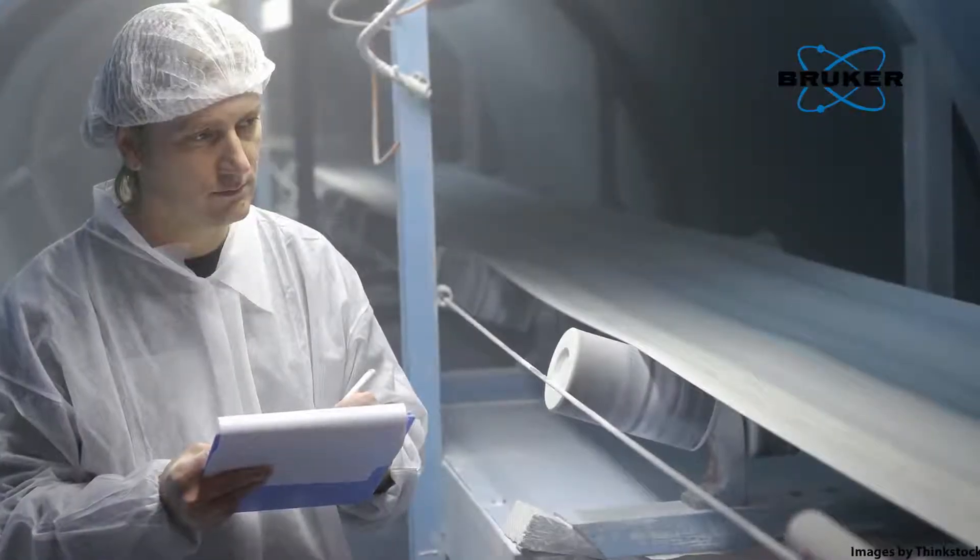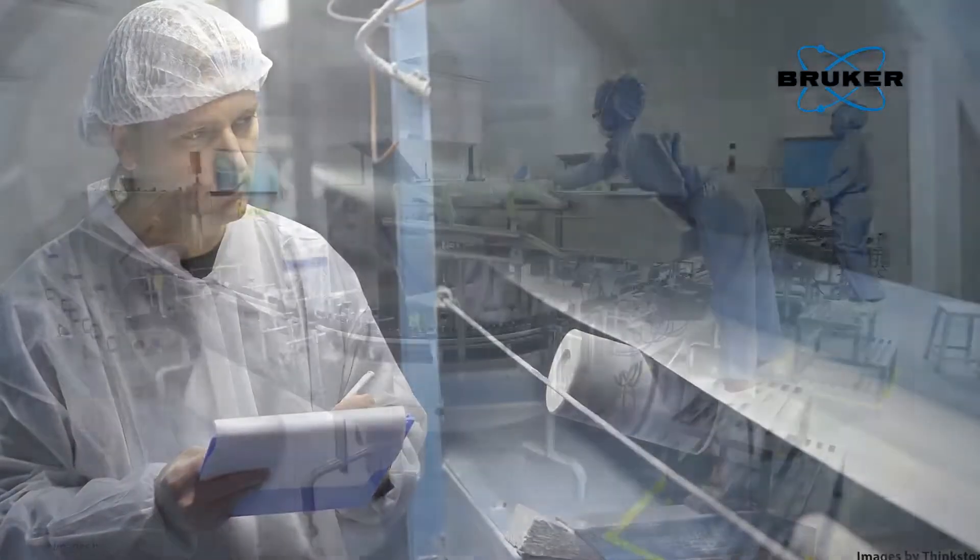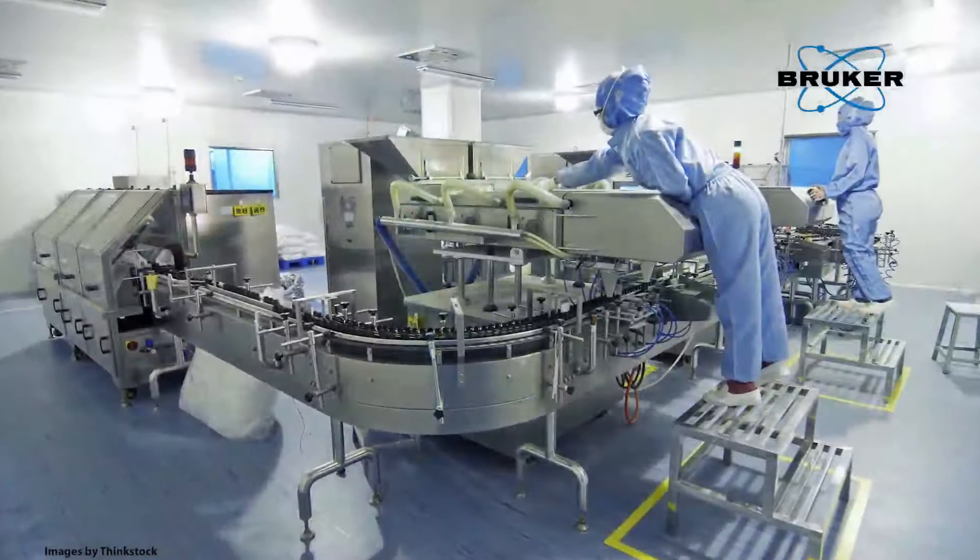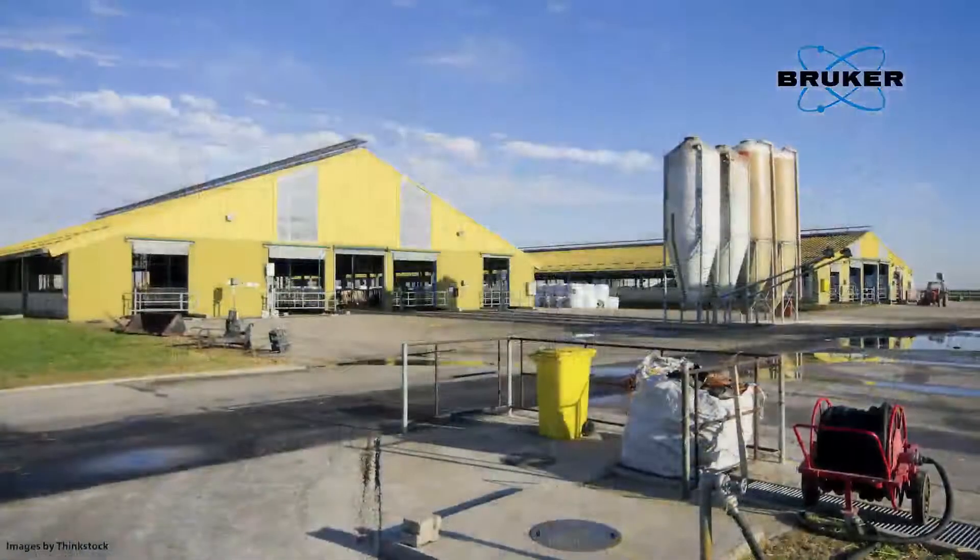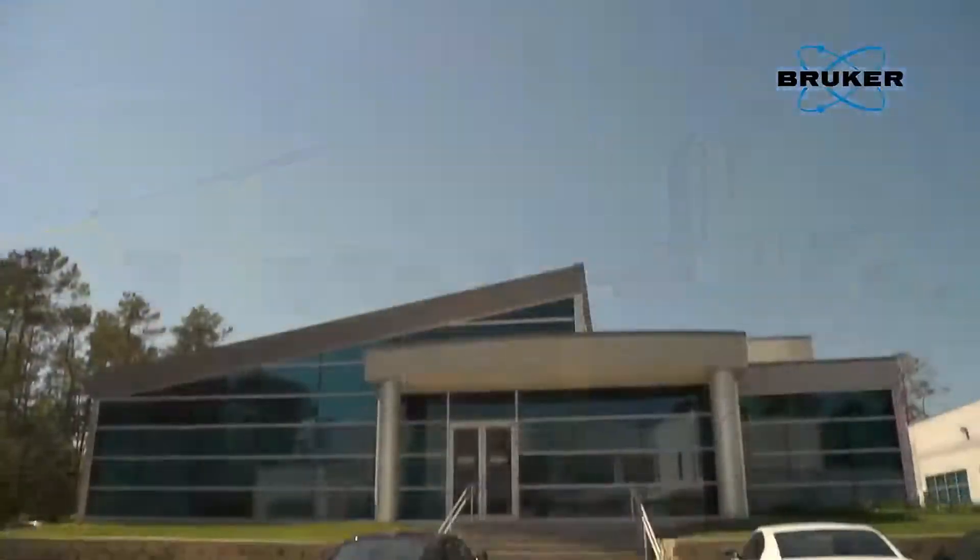FT-NIR spectroscopy is today well-established for quality control applications in all industries, including the pharmaceutical, food, agricultural, and chemical sectors.